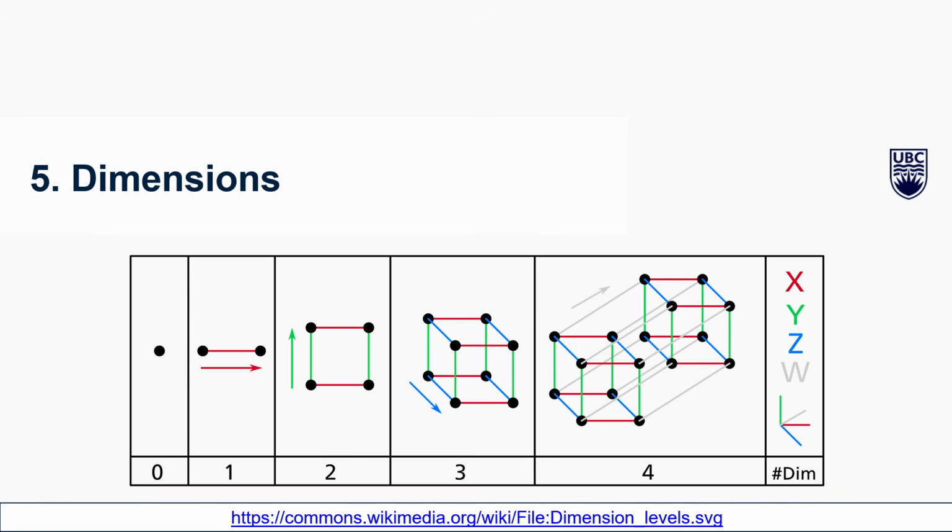Modern microscopy datasets often contain much more information than just rows and columns of pixels. Images may contain multiple fluorescence channels, multiple focal planes, time points, or combinations of these dimensions. Understanding image dimensions is essential for accurately measuring biological structures and effectively working with multiplex immunofluorescence data in QuPath.